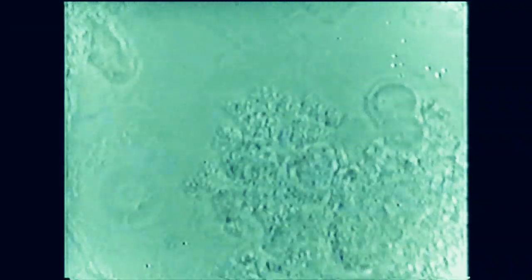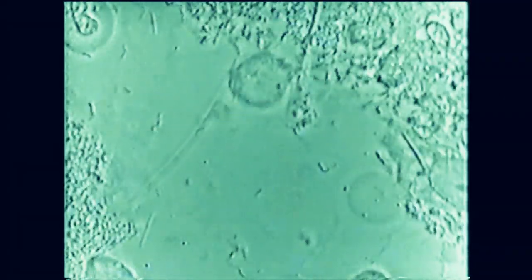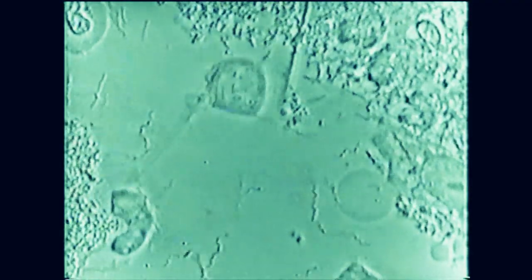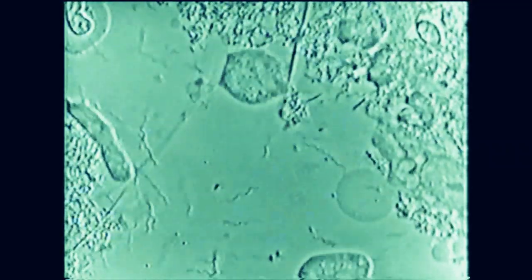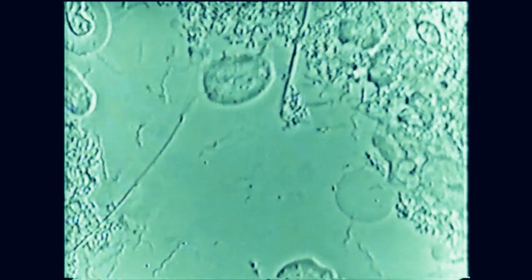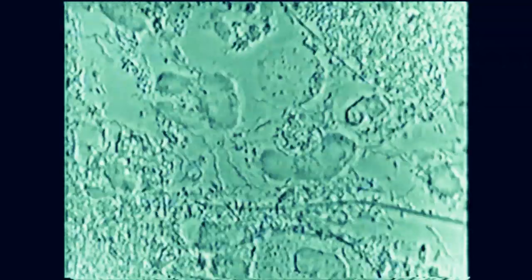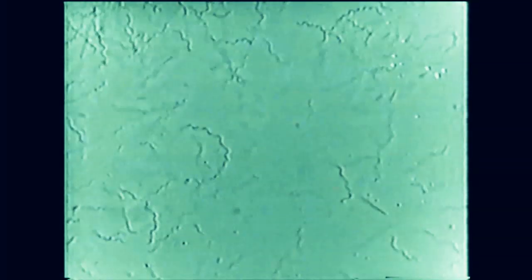Here we have a case of acute necrotizing ulcerative gingivitis, and we see clearly on the microscope the biofilm around the teeth under the gum. You see there are many spirochetes, of course, and also many trichomonas that are present and very motile. We also see red cells, some more trichomonas protozoa, different bacteria, spirochetes, and inflammation here.